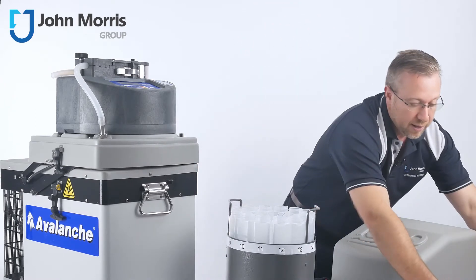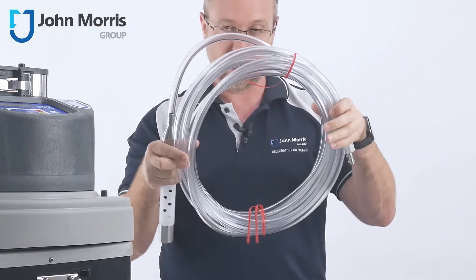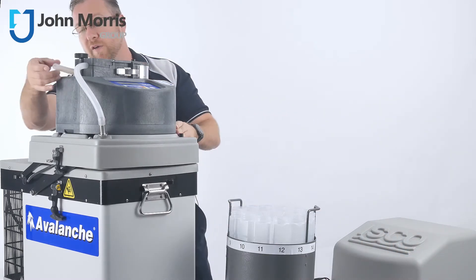We normally supply it with a strainer and a suction line, and that connects directly up to the pump tubing on the sampler.